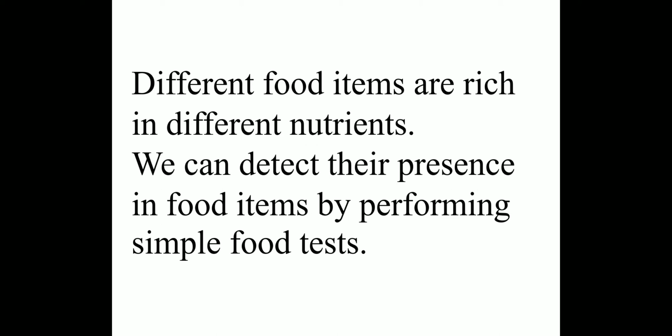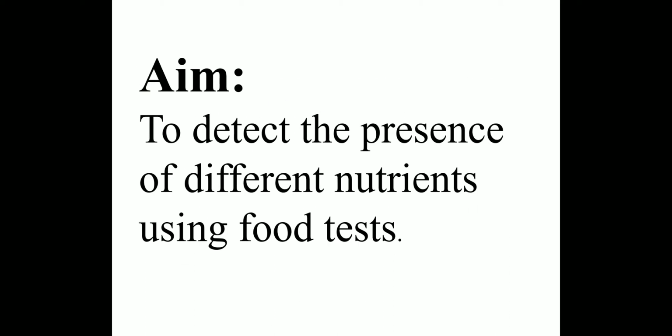Now, in today's session, we are going to test the presence of nutrients such as carbohydrates, proteins, or fats in the food substances through simple experiments. Different food items are rich in different nutrients. We can detect their presence in food items by performing simple food tests. So, today our aim is to detect the presence of different nutrients using food tests.